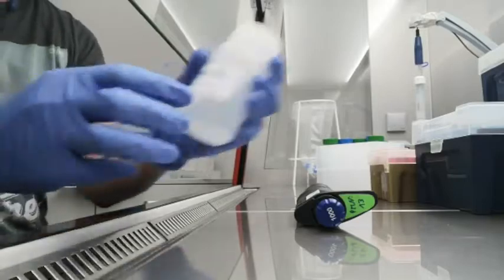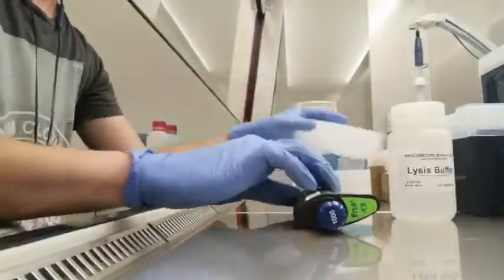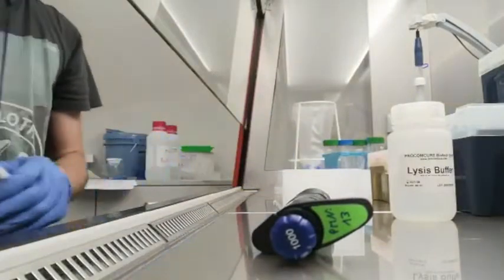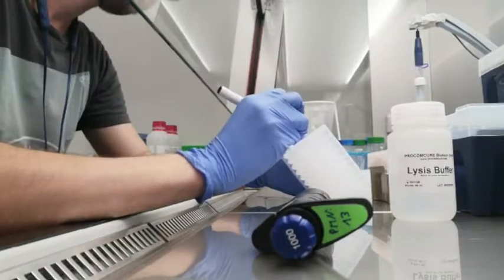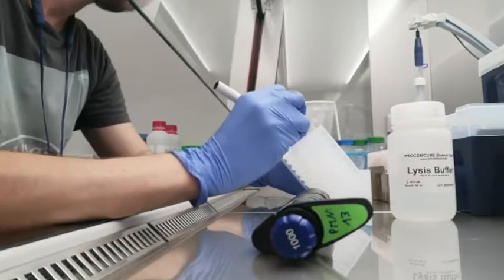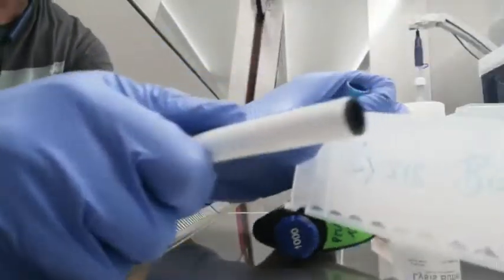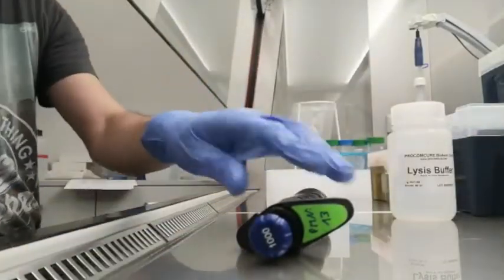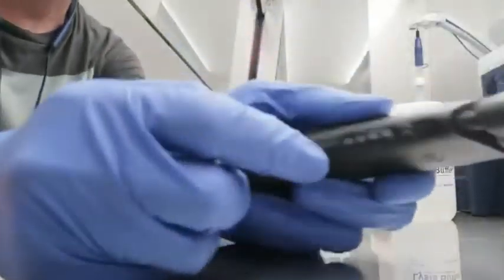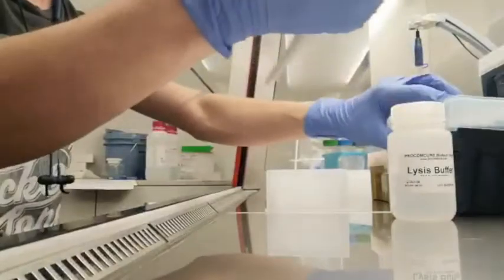Put away the wash buffer plate and then grab a new plate again at 2 milliliter with a deep well plate. It is the same plate that is used for a Kingfisher instrument. And pipette 600 microliters of lysis buffer in each well, where you want to add a sample.